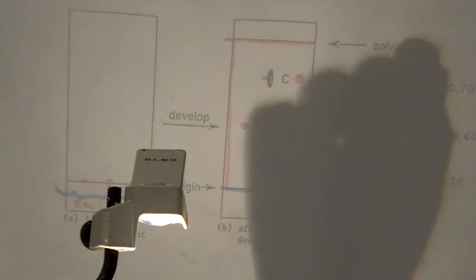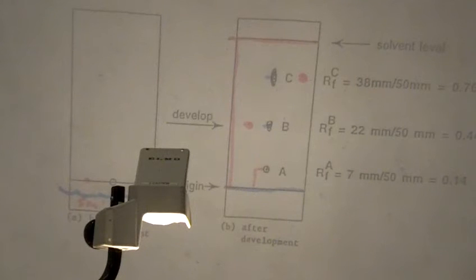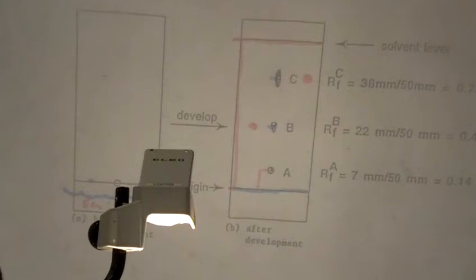So the TLC plates that we have a dye that's UV active, and so if you have spots on the TLC plate, the way you'll see them is by looking, as long as the compounds themselves are UV active, you'll look under a UV light to be able to see what spots are on your TLC plate, okay? And we've set it up so that what you're going to be looking at is all UV active so that you can see it, okay?